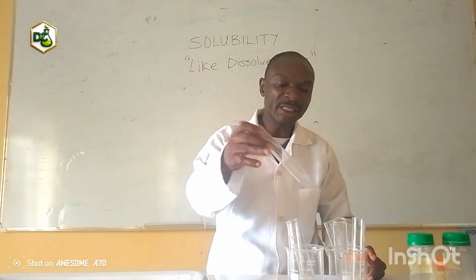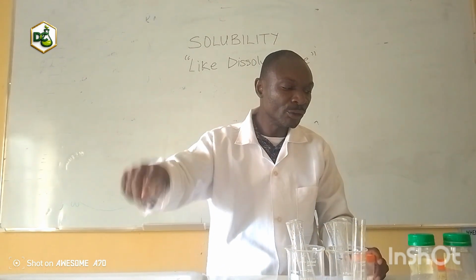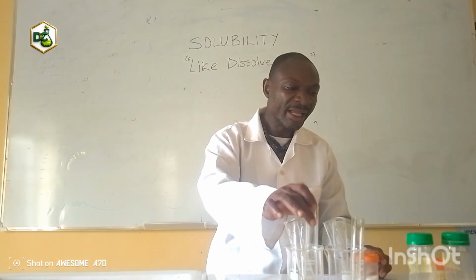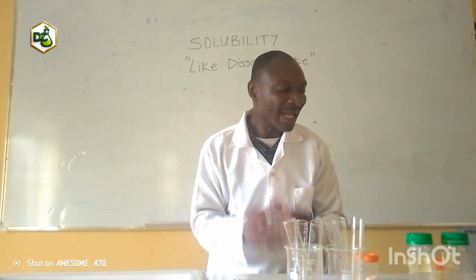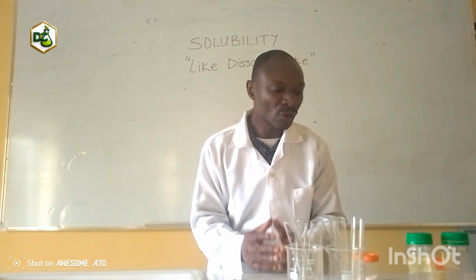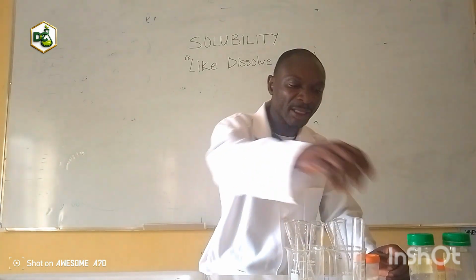Now I will introduce them to a liquid to find out whether it is soluble or not. Now, let's find out.